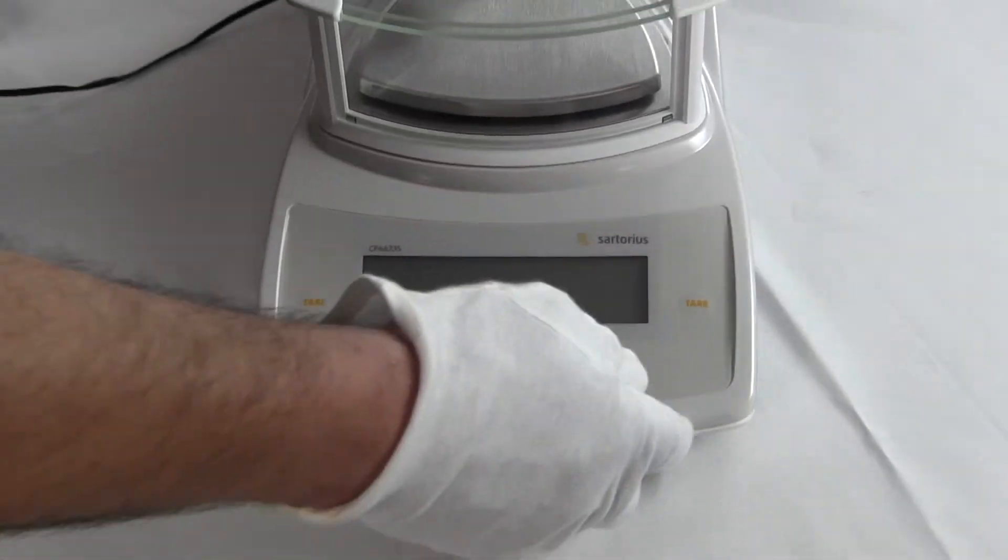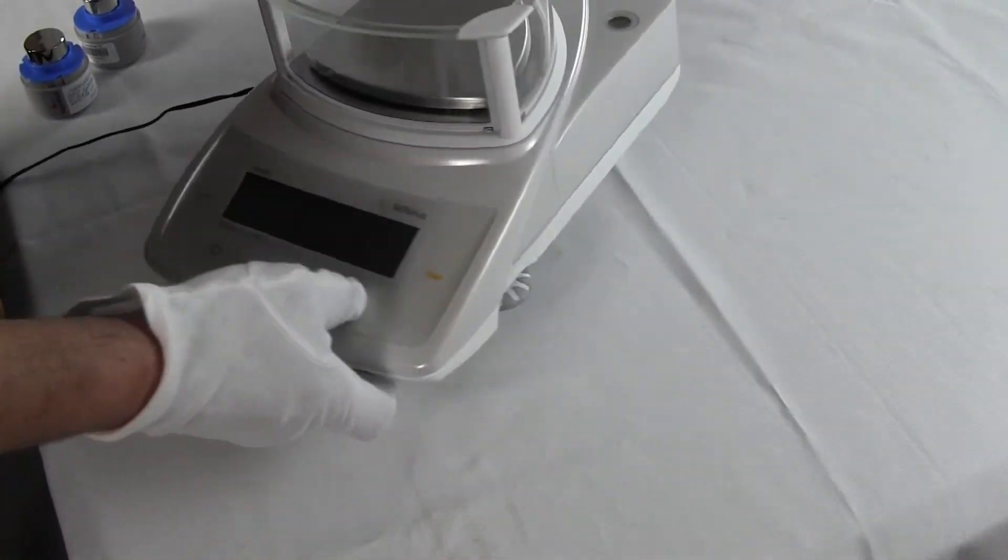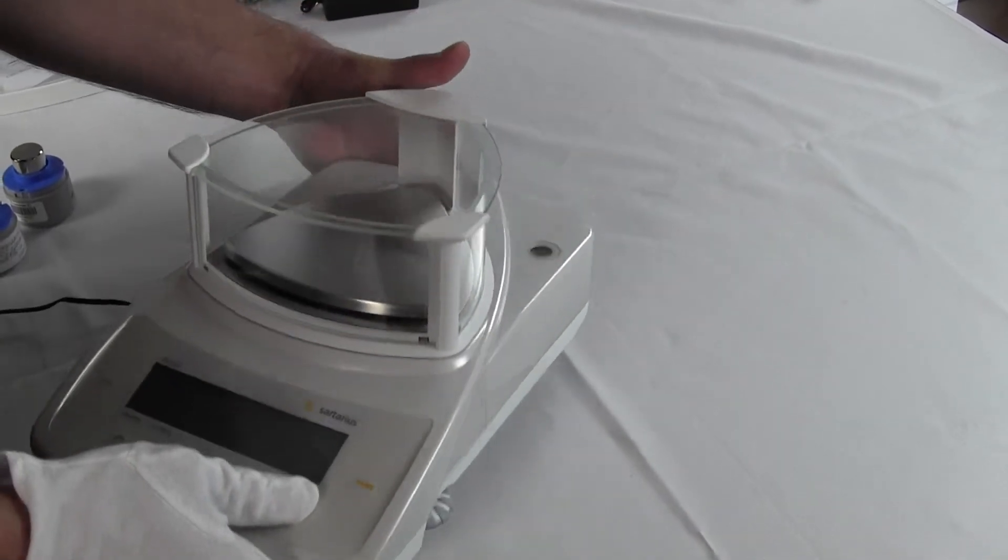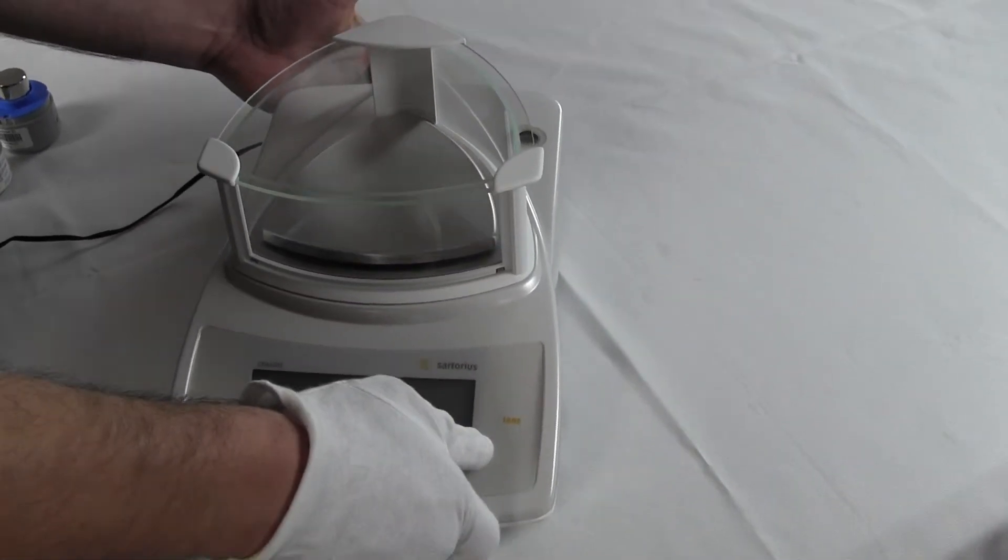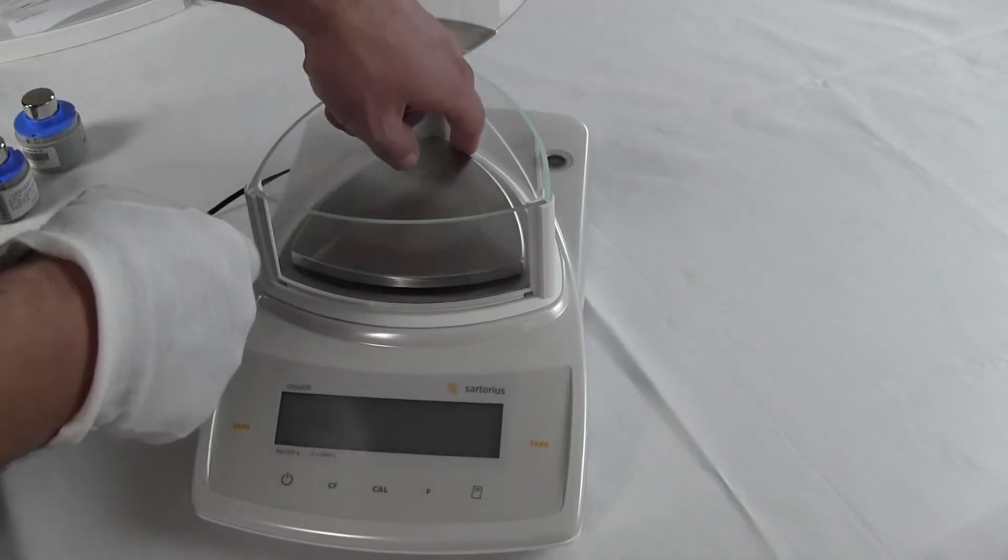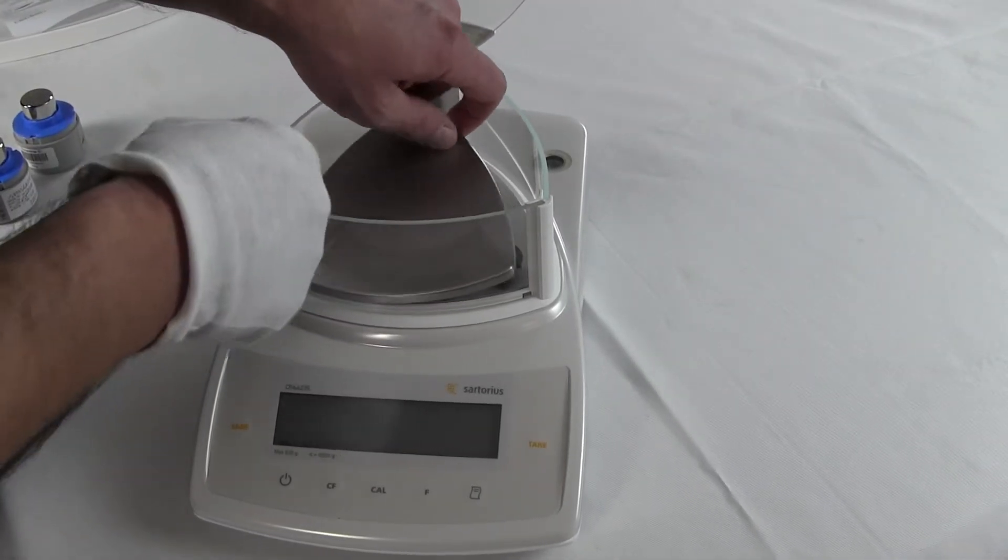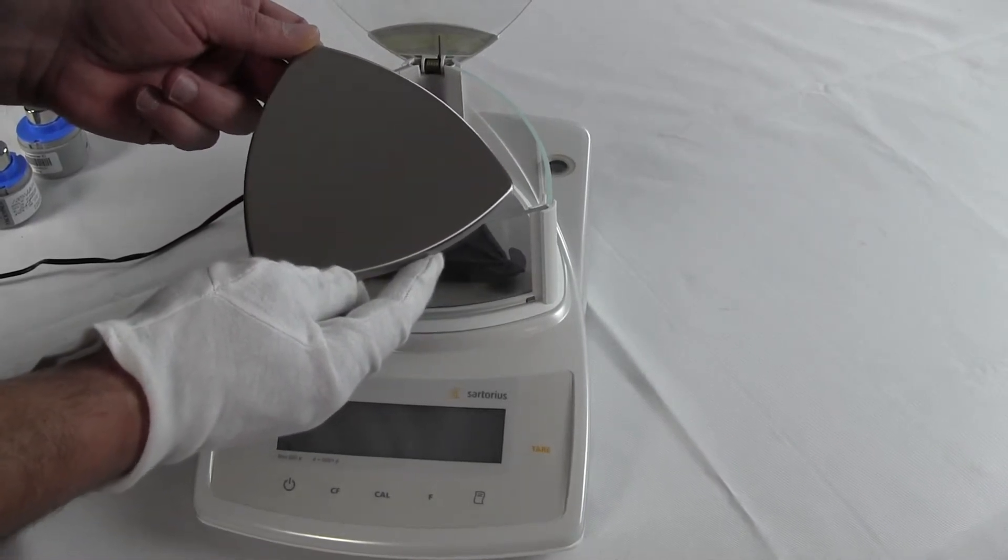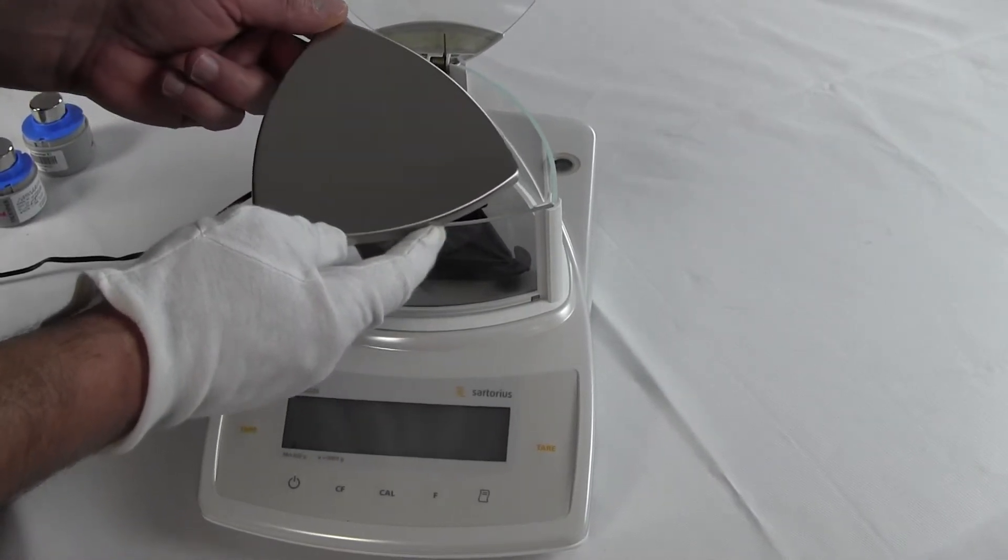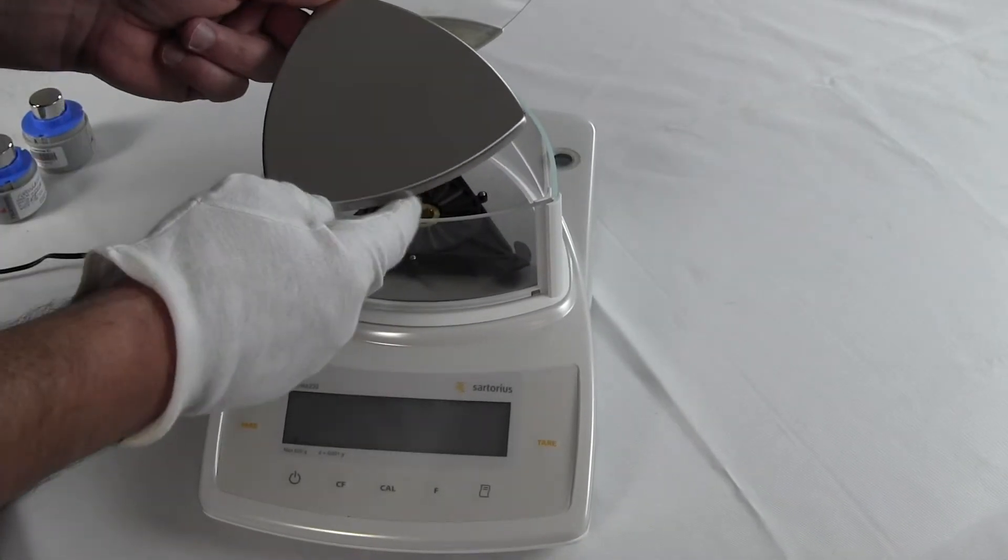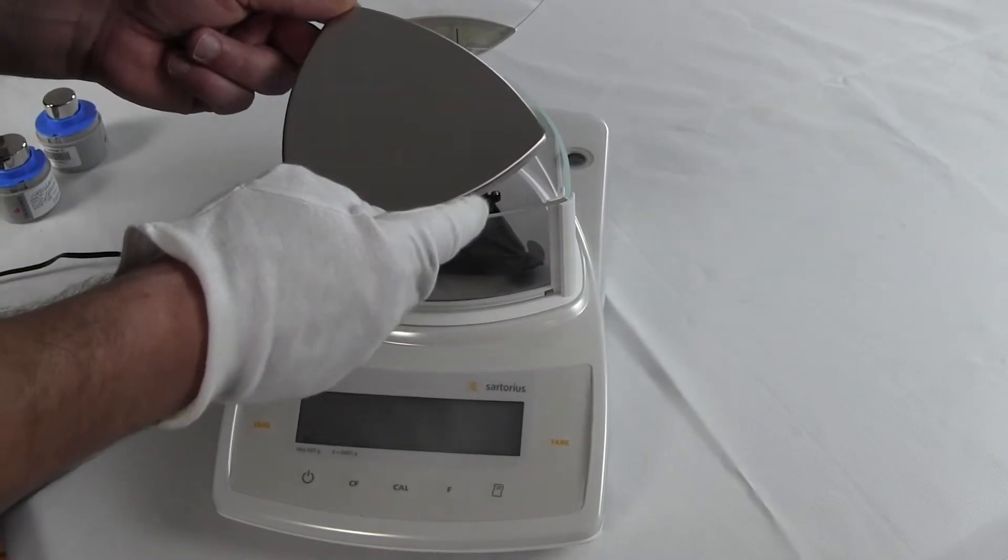Some of the additional features on this balance I'd like to show you. The balance has two adjustable feet on the bottom. Let me take off this draft shield so I can turn the balance around and show you some of these features. This has a nice triangular stainless steel platform.